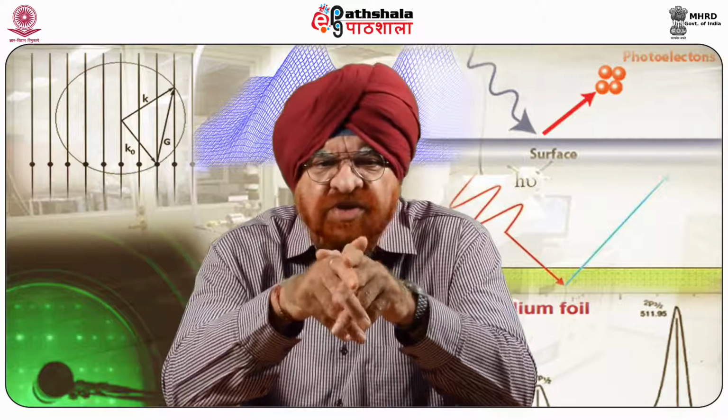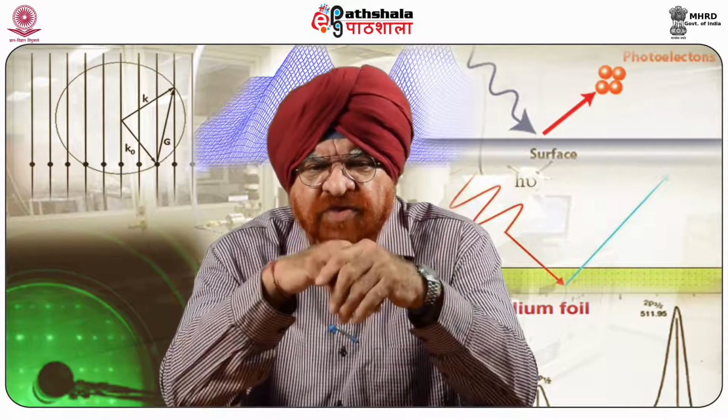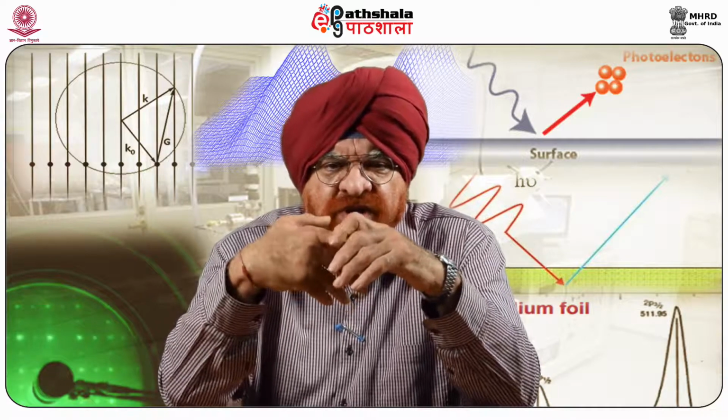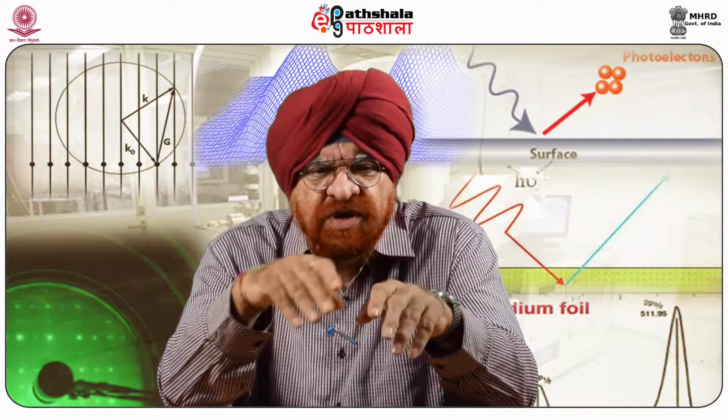Minor and major differences between smooth surfaces are shown dramatically in a very clear manner with the help of this. On one hand, the AFM can resolve very tiny features, even a single atom that is present can be seen.